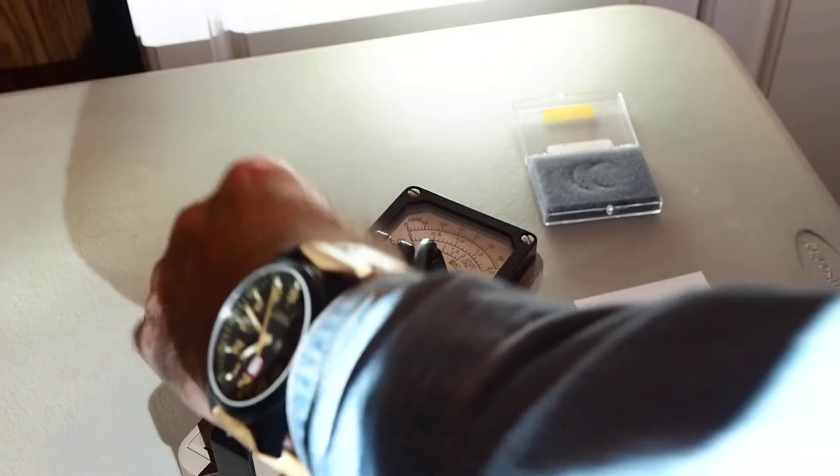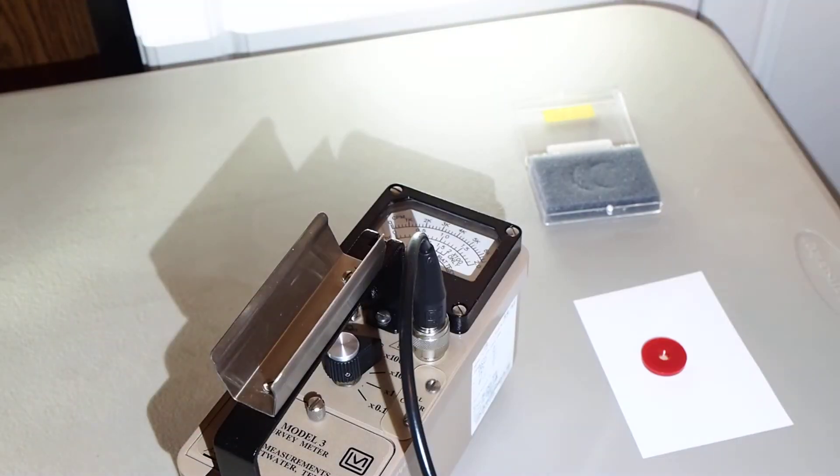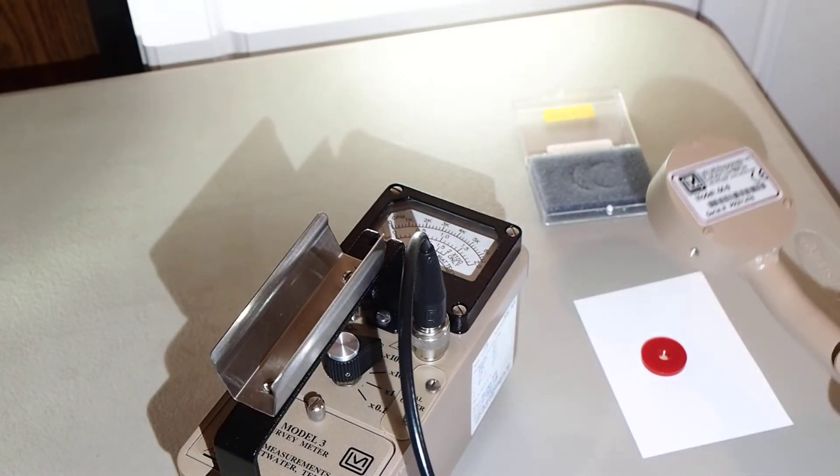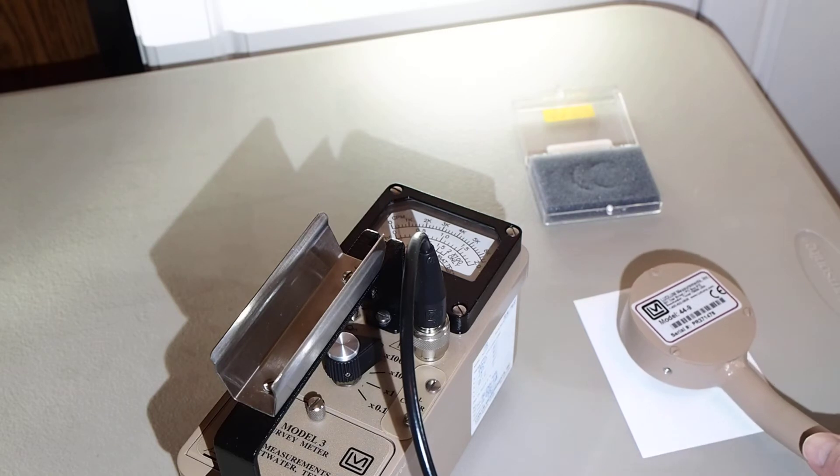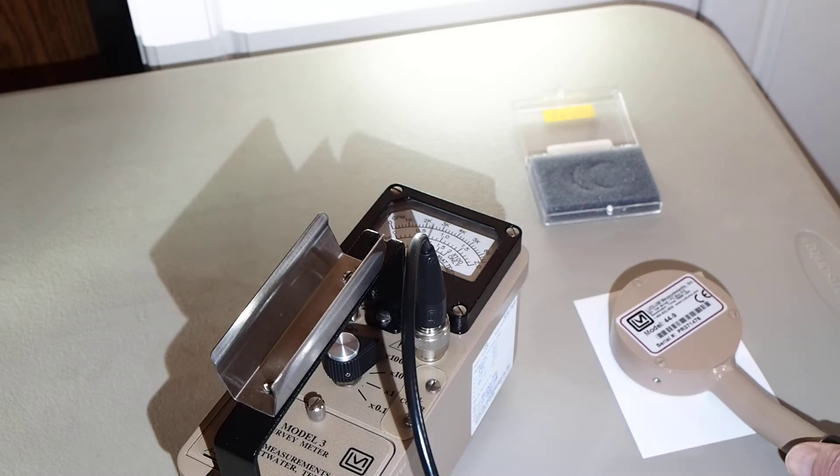So let's reset our meter, go up to the times 10 scale, which will read up to about 60,000 counts per minute. Alright, we're peaking out in immediate proximity to the disk source, about 24,000 counts per minute.